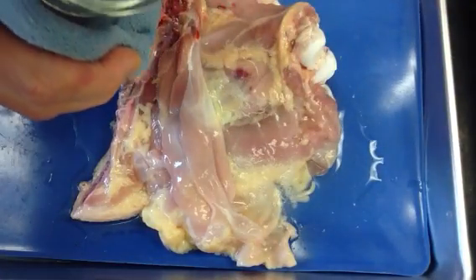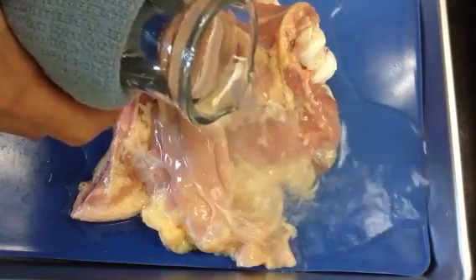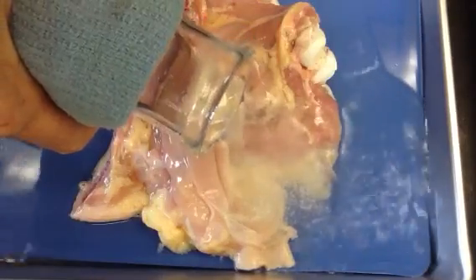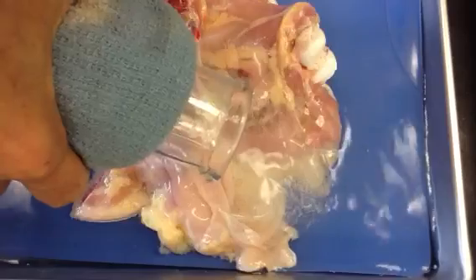We're going to pour some hot water. I don't know if this is hot enough, but we'll give it a try. And if it's hot enough, the collagen fibers start to show up.